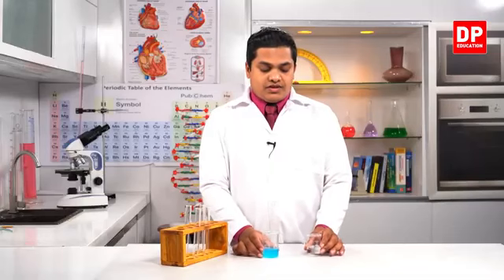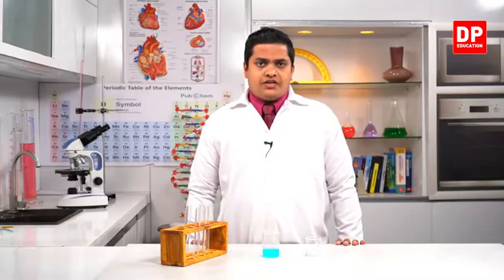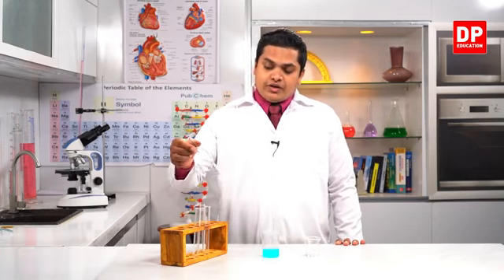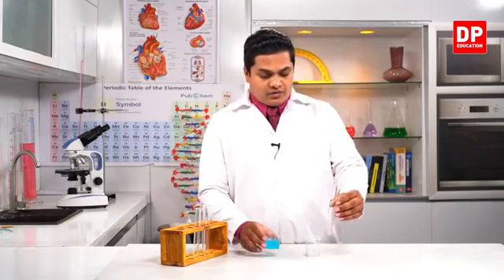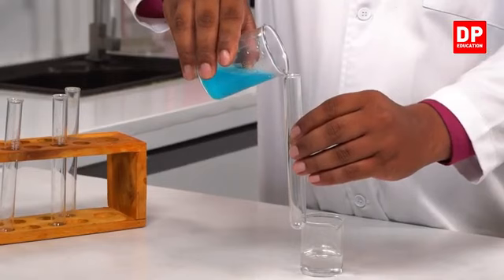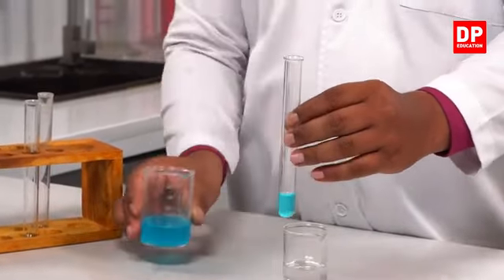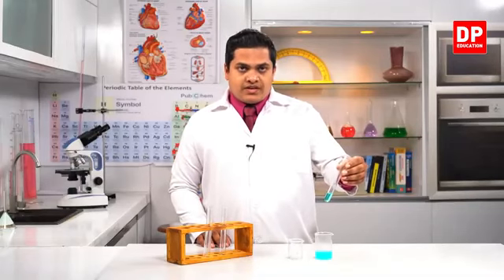So I'm going to mix these two solutions and observe what kind of a change is going to occur when I add these two solutions together. So let's take a boiling tube and I'm going to add some amount of copper sulfate. Right, my dear children, now this is my copper sulfate solution.